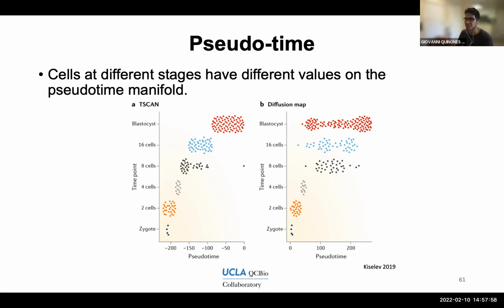one plane in our high dimensional structure, where this pattern is going to become a lot more obvious, a lot more continuous. And in this case, our pseudo time, the units, is pretty much the coordinates in that manifold that we found. And also by looking at how the expression of the genes changes from cluster to cluster, we can infer a trajectory that will connect these different cellular populations.